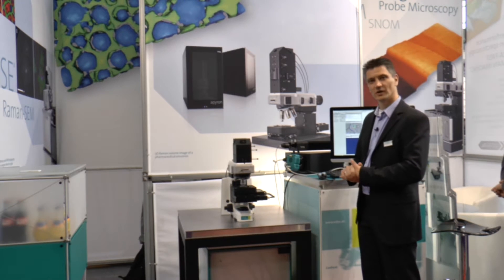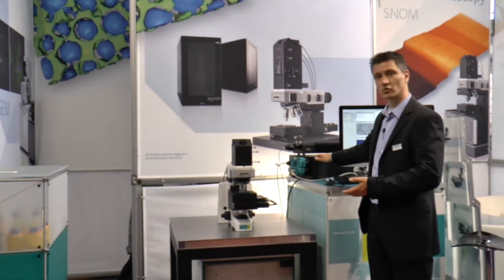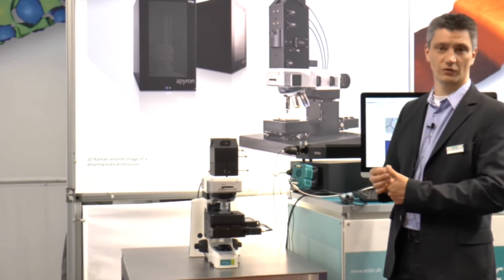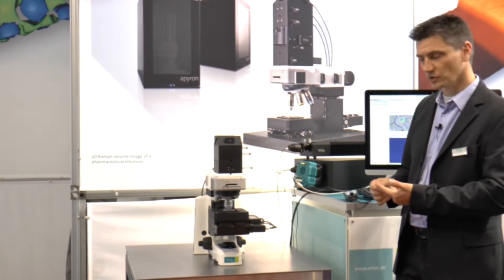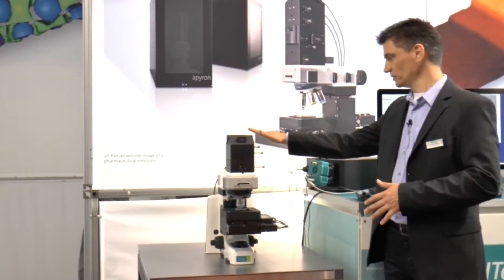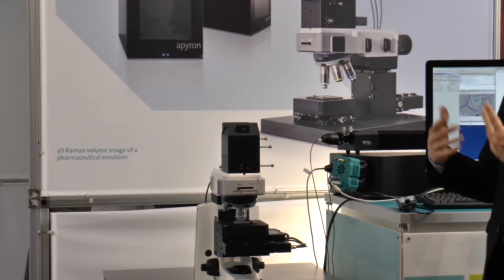This is the XS which we release here at Analytica. The XS is part of the Alfa 300 family and as such it has a fiber-based laser and a fiber-based spectrometer. The advantage of this setup is multiple. With a fiber-coupled laser you always have a guaranteed diffraction-limited point light source. You're completely independent of where you put your laser, so you've got a completely flexible footprint, and the coupling efficiency typically is 70% to 80%. The spectrometer has the same advantage — direct coupling equivalent with a broadband single-mode fiber, and you can place your spectrometer wherever you want, even under the table to save space in your laboratory.